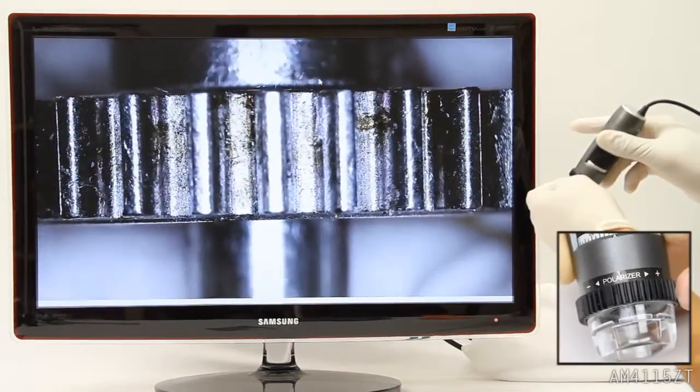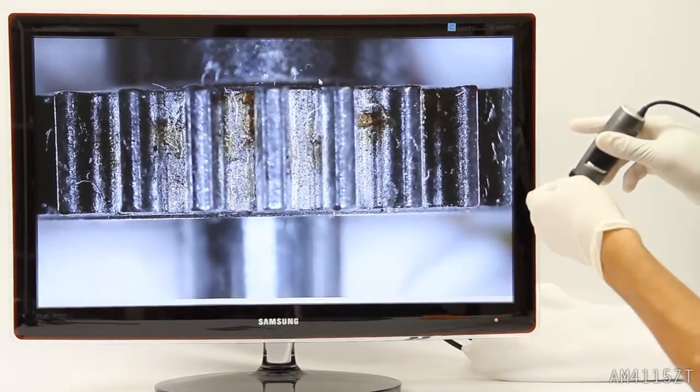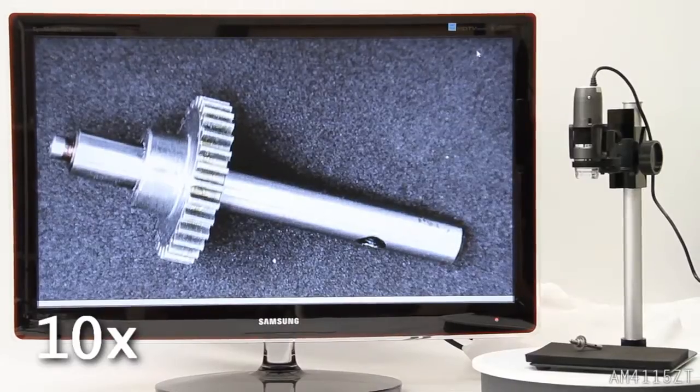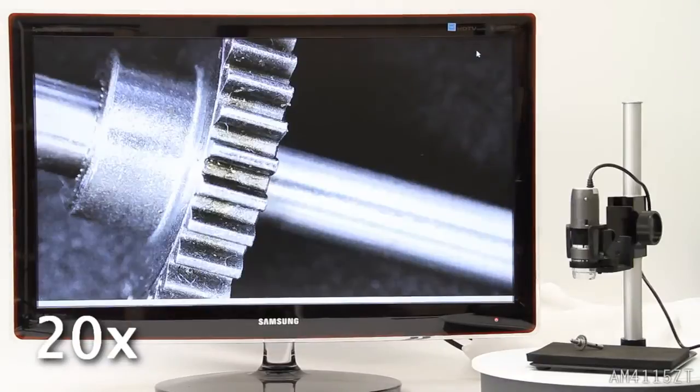Combined with an adjustable polarizer, this model offers stunning image quality while revealing more details and reducing surface glare and reflection.